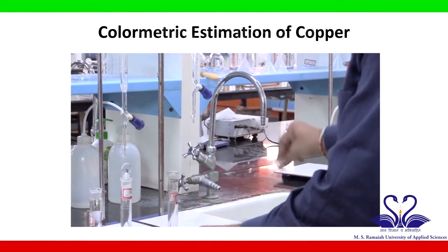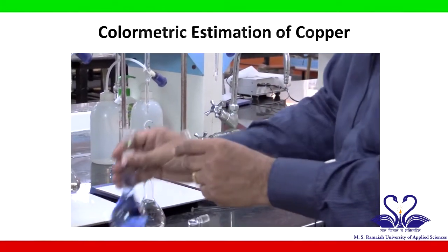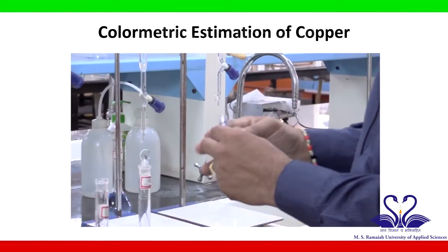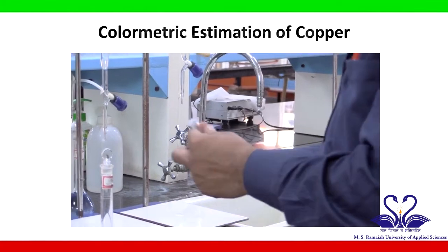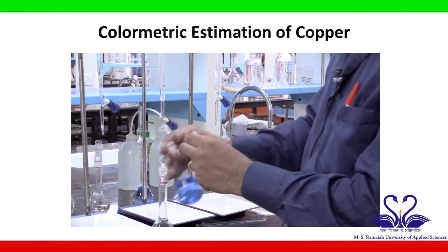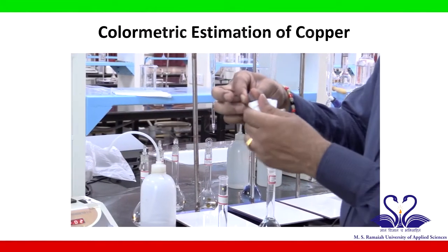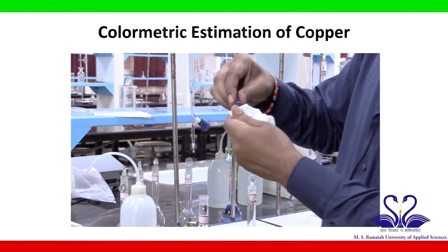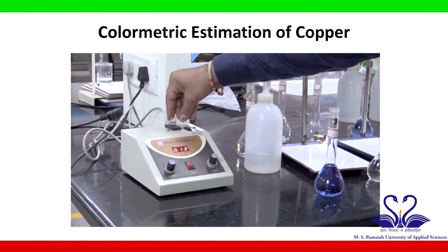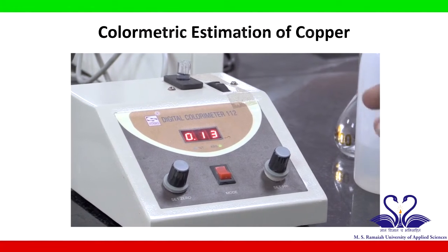rinse it, wipe it thoroughly, place it in the same direction and note down the absorbance for the second standard solution.